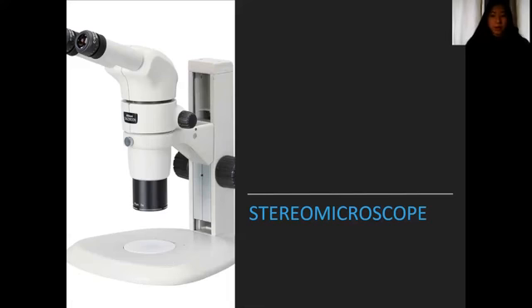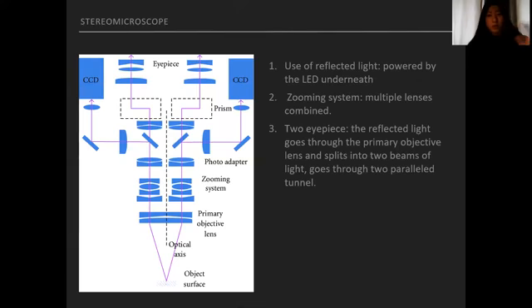So a quick recap on what exactly is a stereomicroscope. On your left is a ray diagram of the stereomicroscope. It comes from right here. This is where the specimen would be located. All the way, the light rays go up, and then go to your eyepieces, the 2 eyepieces right here. Ignore the CCD, we don't have that in this case. So again, this is a stereomicroscope.